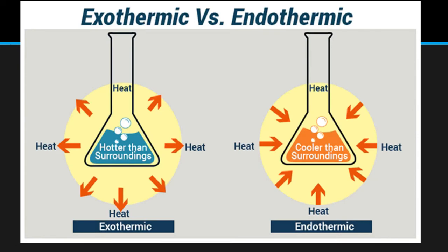So I'm thinking probably the guy with the cold water tube got a little bit of air in there, and that's why that bubble was so big. So it's good to know that I'm not the only one who has imperfect science experiments.